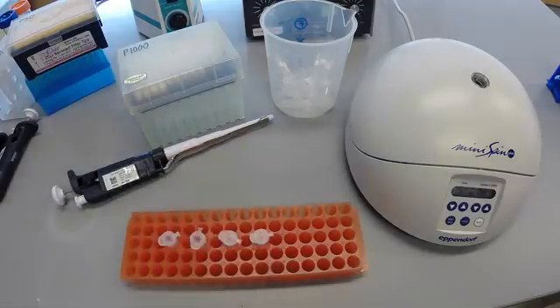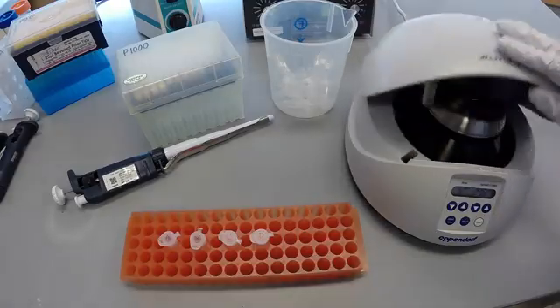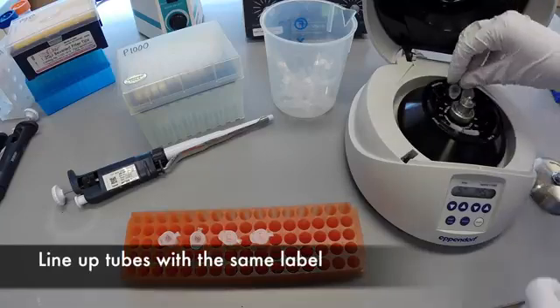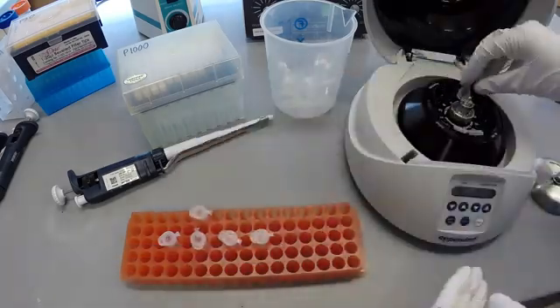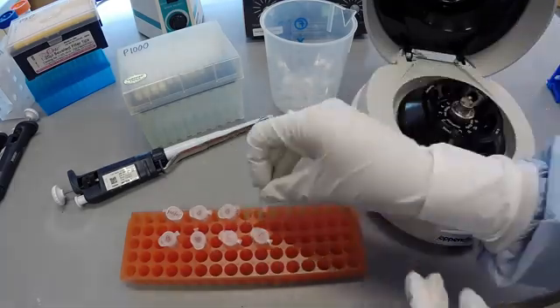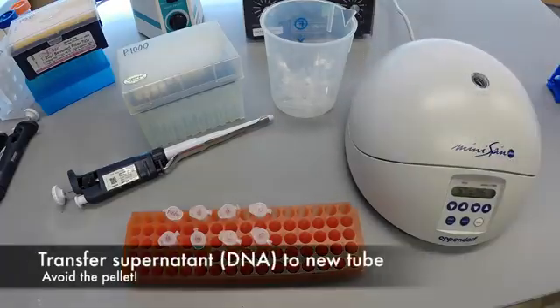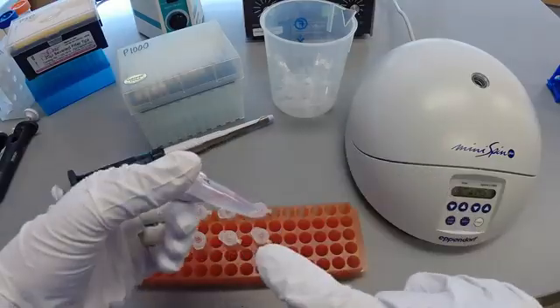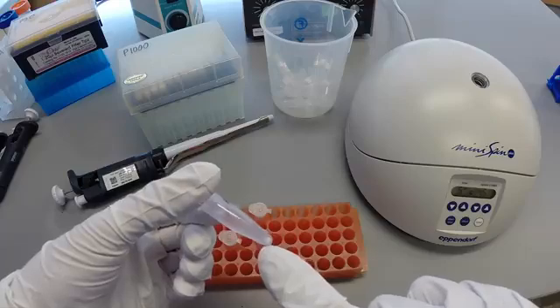When the spin is complete, the lid to the centrifuge will pop open. Remove the internal lid and remove the samples gently to avoid disturbing the pellet. Place tubes of the same sample in line with each other to ease the transfer of the solution. After centrifugation, you should be able to see a white pellet that has collected on the bottom part of the tube on the side of the hinge.